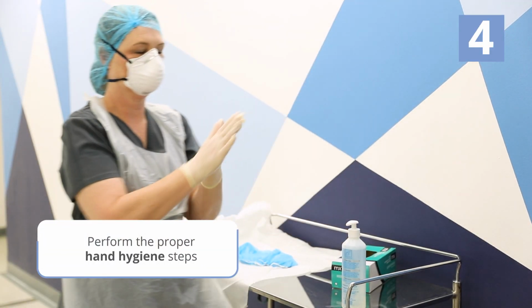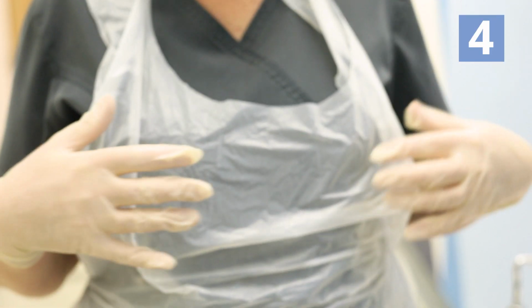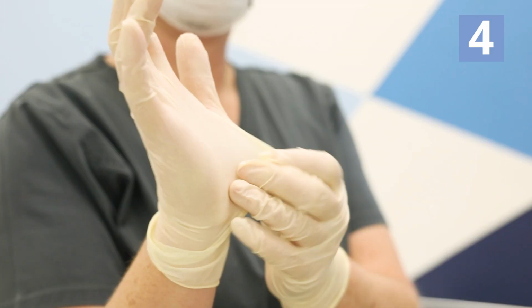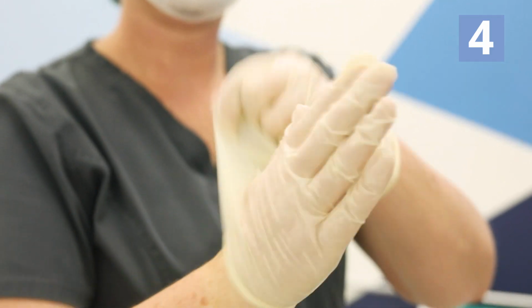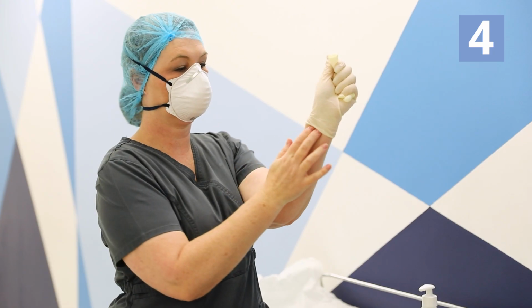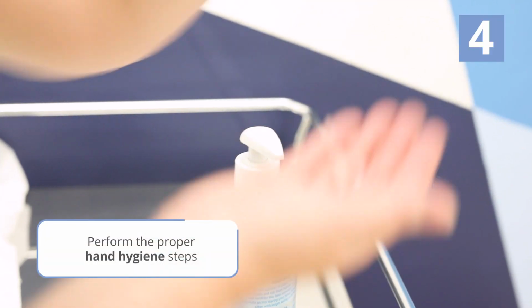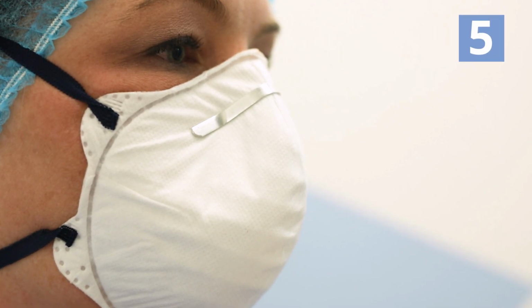Perform hand hygiene. Next, remove your apron by touching the outside and pulling it away from your body and discard it as infectious waste. Next, remove your gloves by securely grasping the outside of your glove with the opposite gloved hand. Slide your fingers of the ungloved hand under the remaining glove at the wrist, then peel off and discard. Perform hand hygiene. You can now remove your mask.